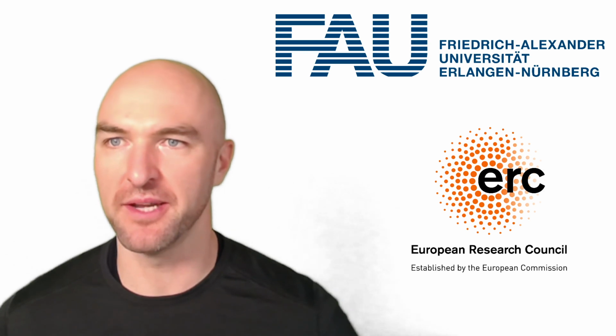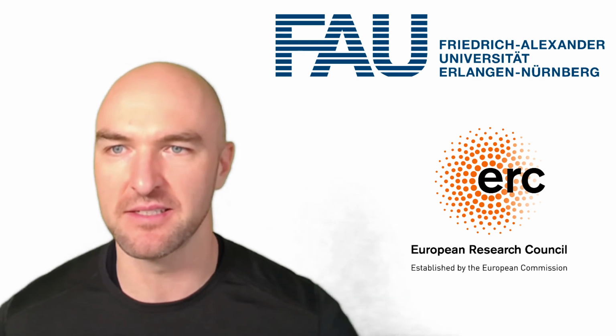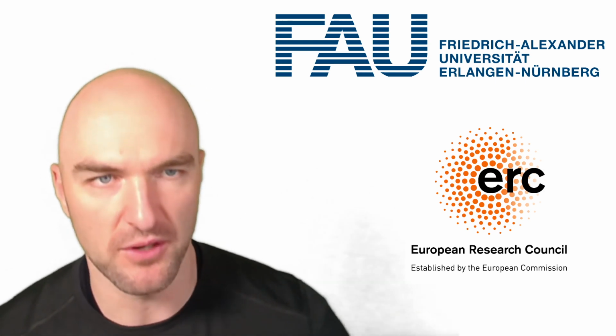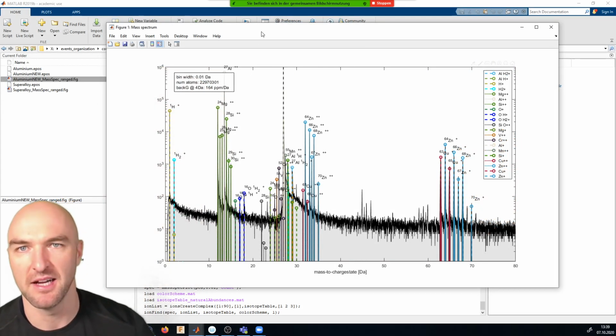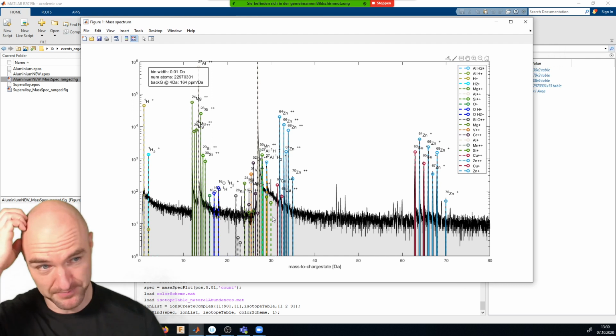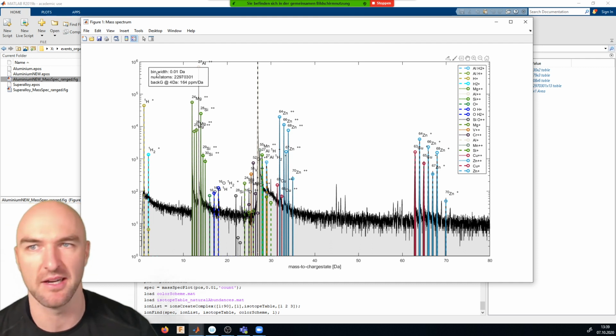Yeah, so we'll just quickly go into the mass spectrum ranged figures, just so that I can show you some of the things that you can get out of the mass spectrum figure if you need to work with it. First of all, if you have newer versions of MATLAB, you can export the figure very easily as a vector graphic. So if you write a paper and you need to provide a mass spectrum, for example, it's very easy to just go here and export it as a vector graphic and just copy it into Illustrator, Inkscape, or whatever vector graphics program you're using.